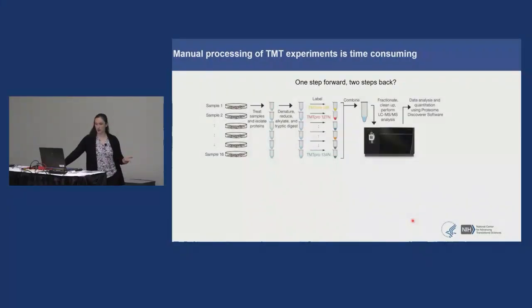And what we turn to using are TMTs. So essentially with a TMT, you can label, in our case, up to 16 differentially treated samples, digest down to the peptides, label the peptides with the differential tags such that these 16 samples can be pooled together into one injection on the mass spec.